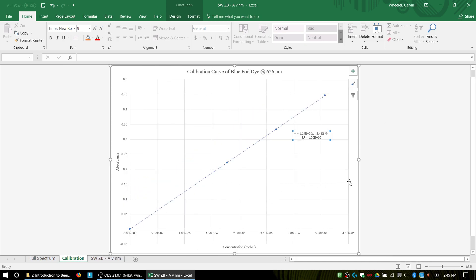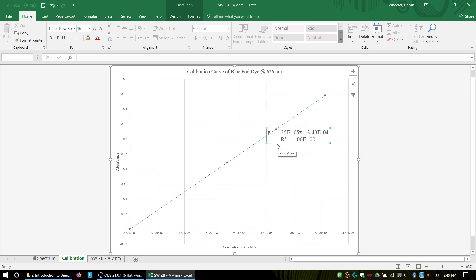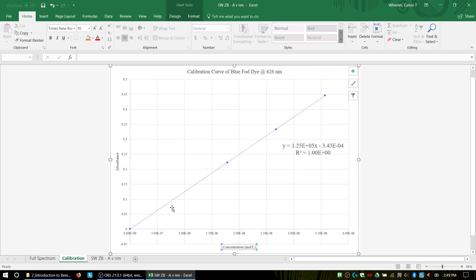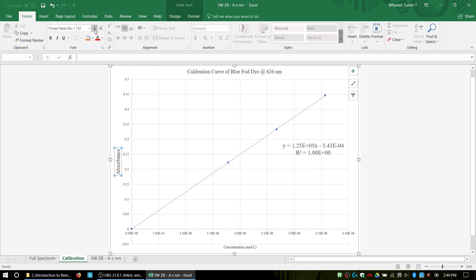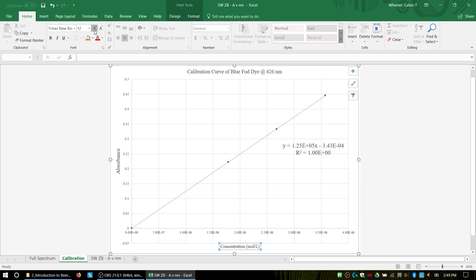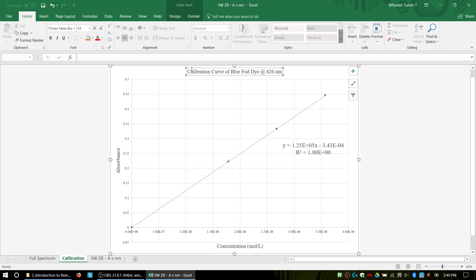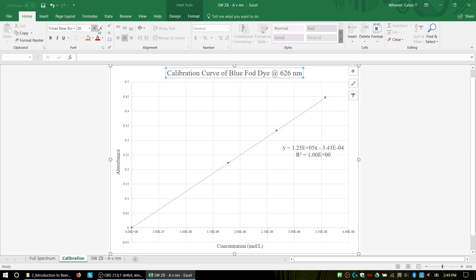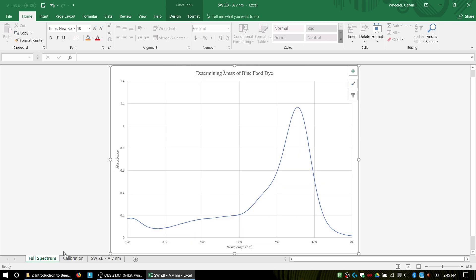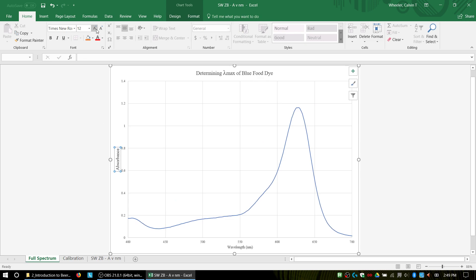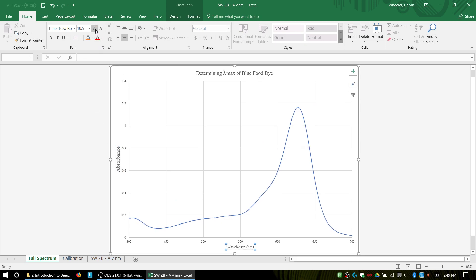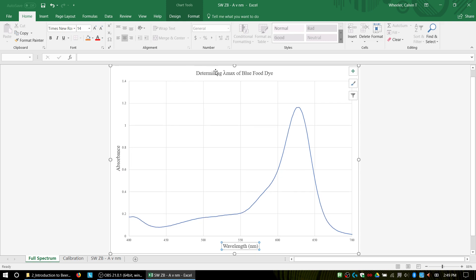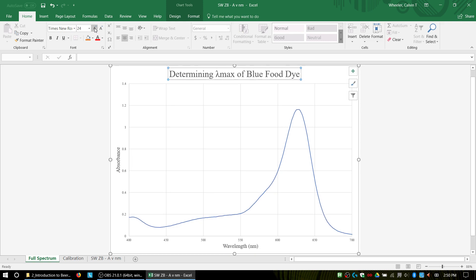So if you want, you can make this look better by making this bigger, so you could see it rather than having to look for it. You could also make your axis titles bigger. I guess you can only do one at a time. I guess I could bring them up to 14. There we go. I can bring my title up to something bigger. I just did 20. Make my other graph match. So these were 14 each. And so at this point, I'm just trying to make my stuff look better.